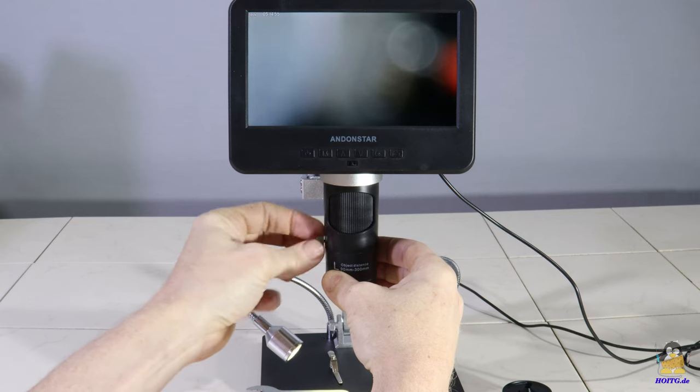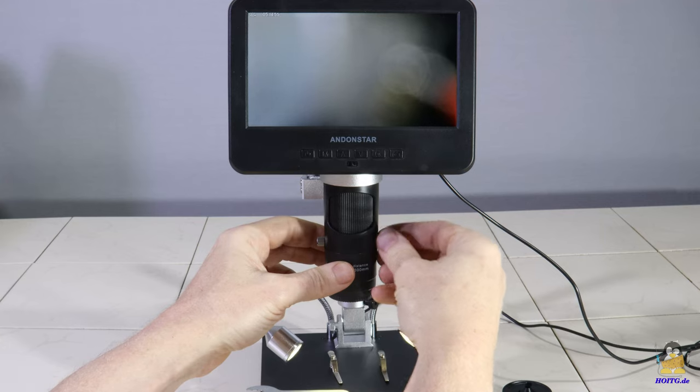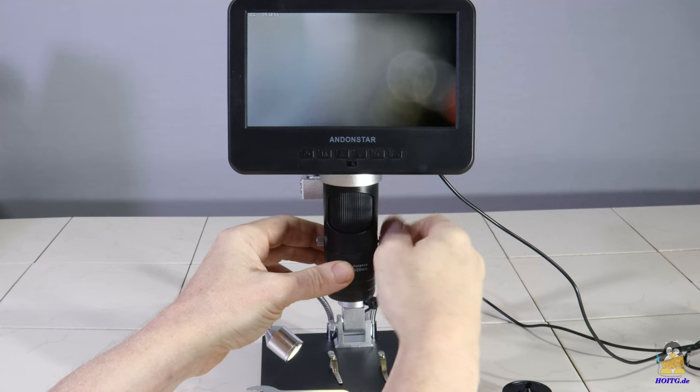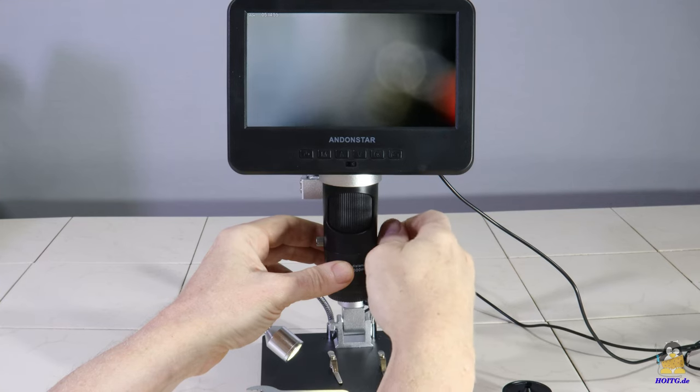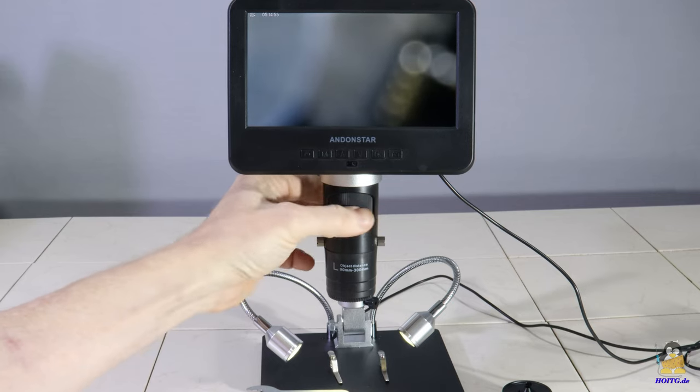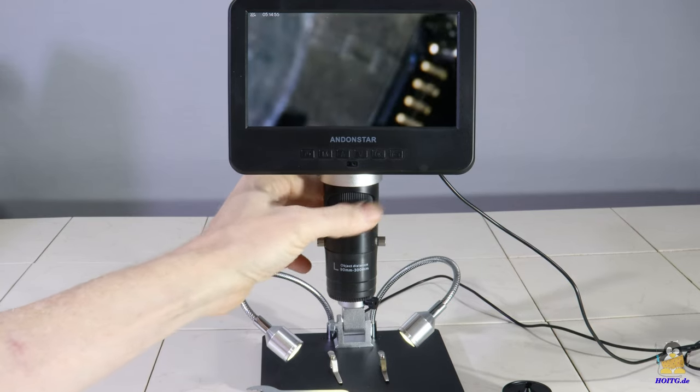This lens is suitable for an object distance of 90 to 300mm. Compared to the first lens, there is a larger magnification with the same object distance.